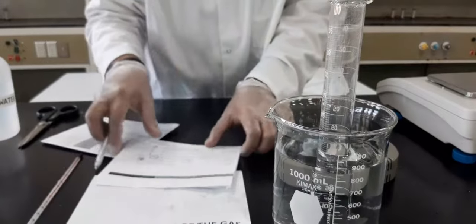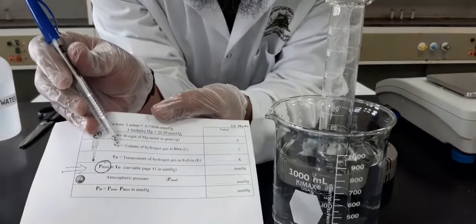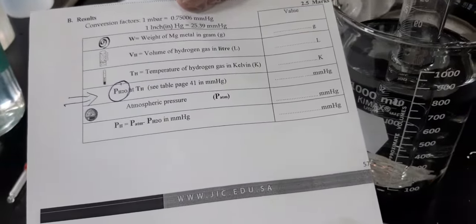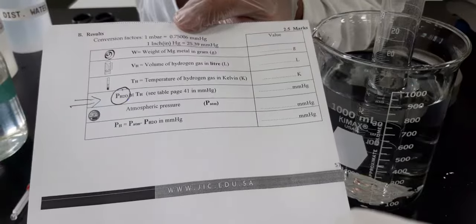Now we are going to talk about one of the important things, which is the volume of the hydrogen gas. Remember, they want you to write the volume of hydrogen gas in liters, and we are having an ml cylinder. So first let us begin with how to perform the observation.